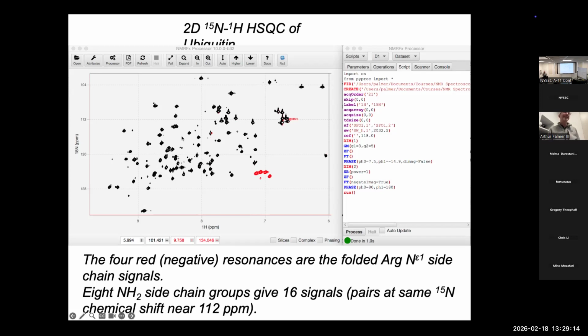So they're there, and we could go find them if we wanted to by doing deuterium NMR. The lines are probably terrible, but they're there.